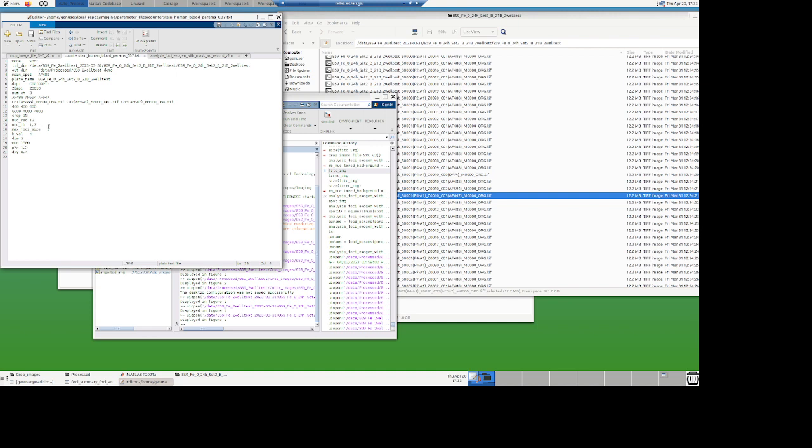Nuc threshold is a relative threshold. So a value of 1 would mean there's no threshold, you take everything. It's a relative cutoff intensity from the background. So you're 70% above the background by having 1.7, in a nutshell.